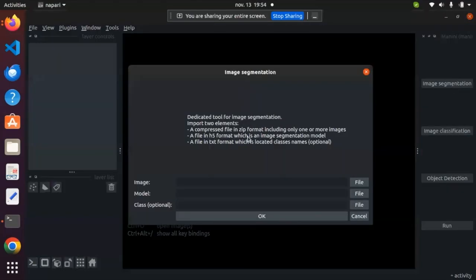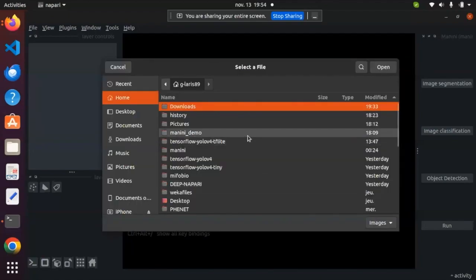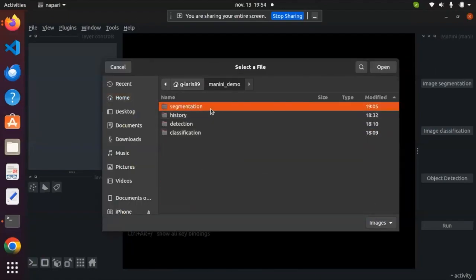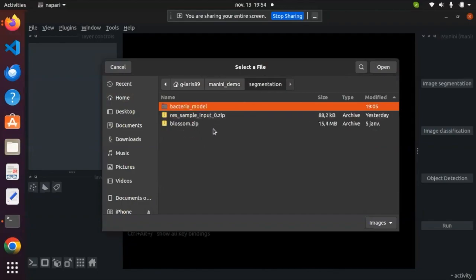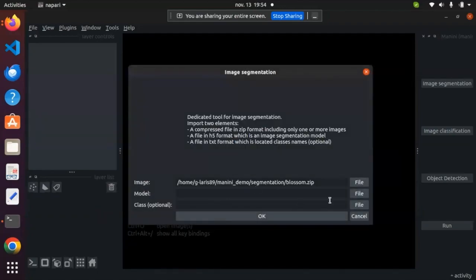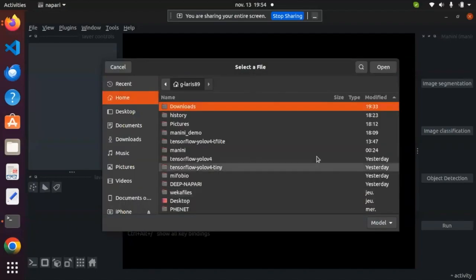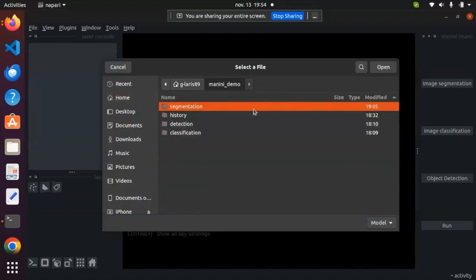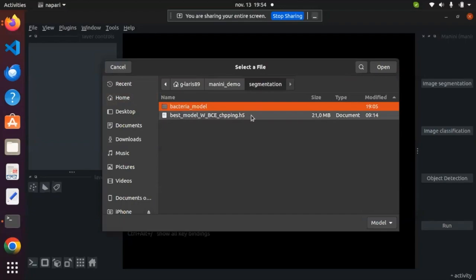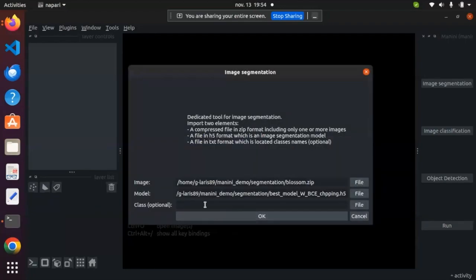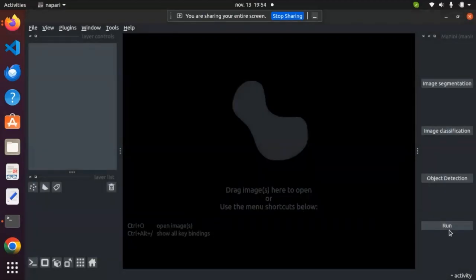Let's start with the segmentation. In segmentation, I have three empty boxes. Let's import the image — I remind you that the image must be in a compressed file. For the model, I can find it here. The class is optional, so it's not mandatory. I click OK and run it.